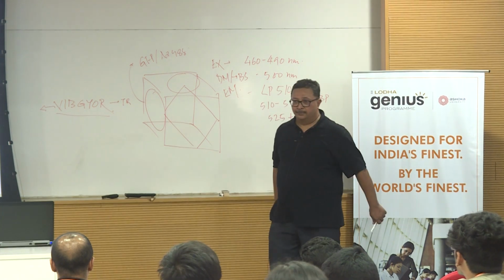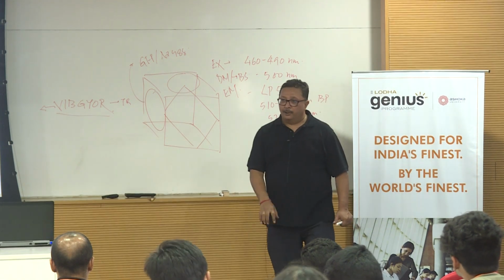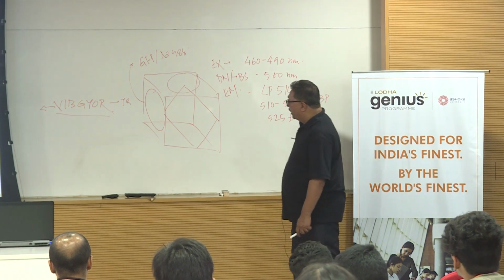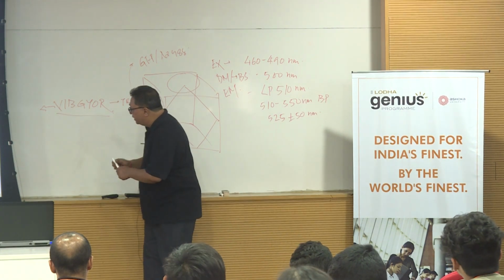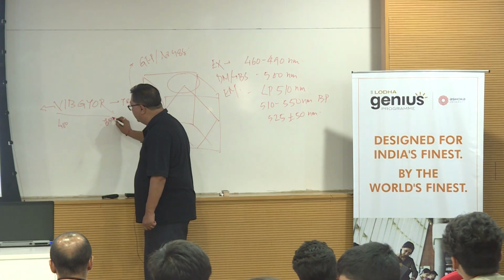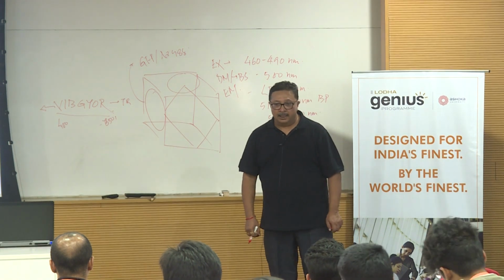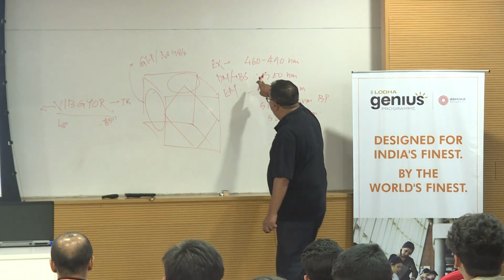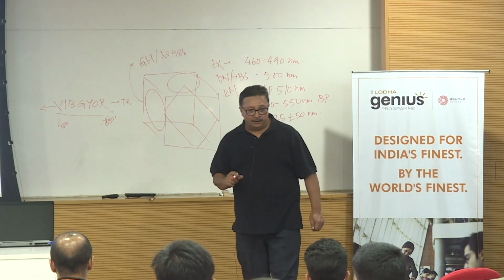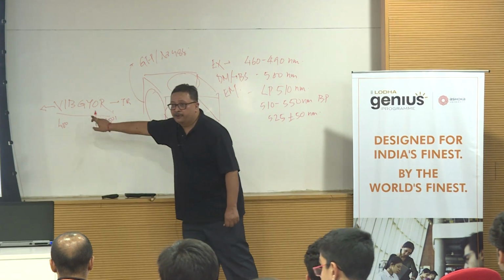Sure, I'm coming to that. Okay, so these are all wavelengths. Nanometer means wavelength, lambda. Correct? So here, when you say white light, it means that starting from 400 nanometer up till 650 or 700 nanometer, you have the light available. Correct? And then this 460 to 490, if you look at the visible spectrum, what color does it denote?